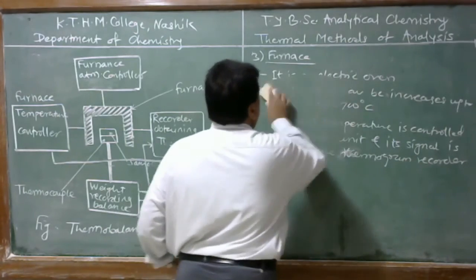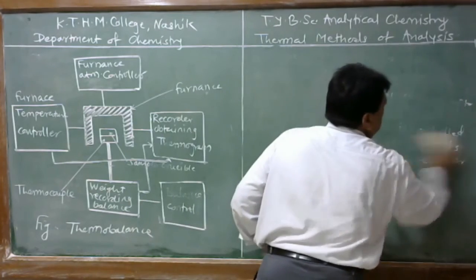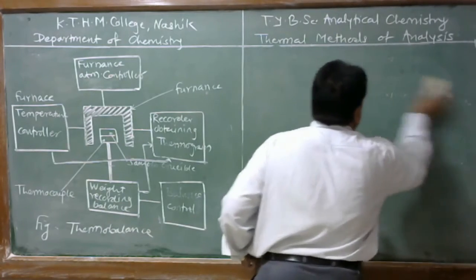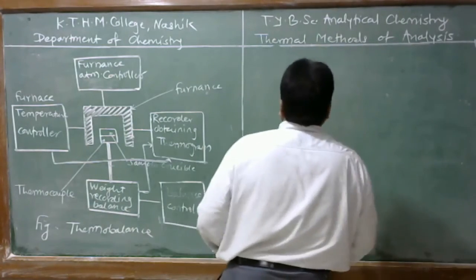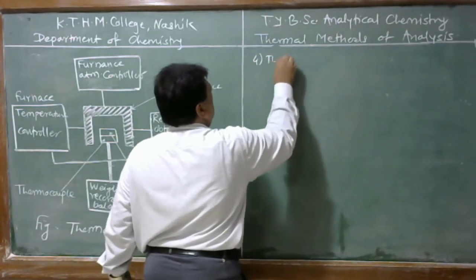Next component, number 4, is the thermocouple.